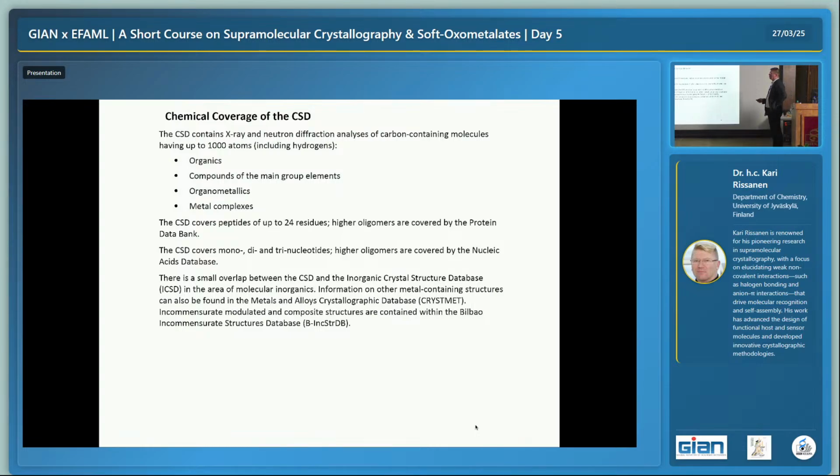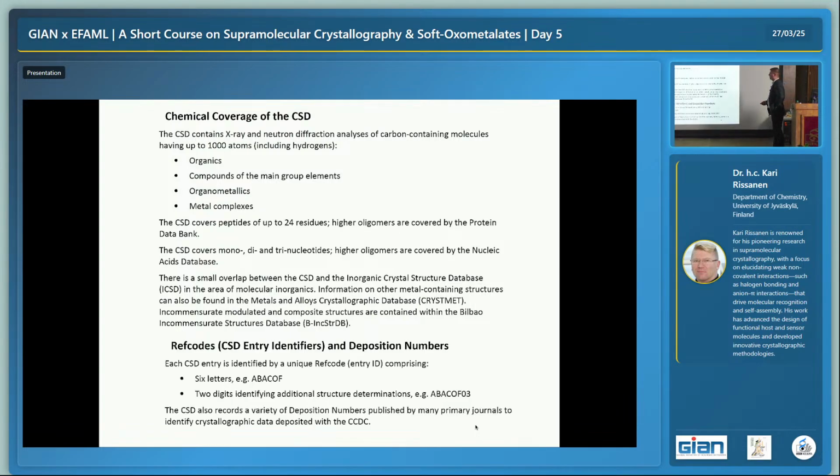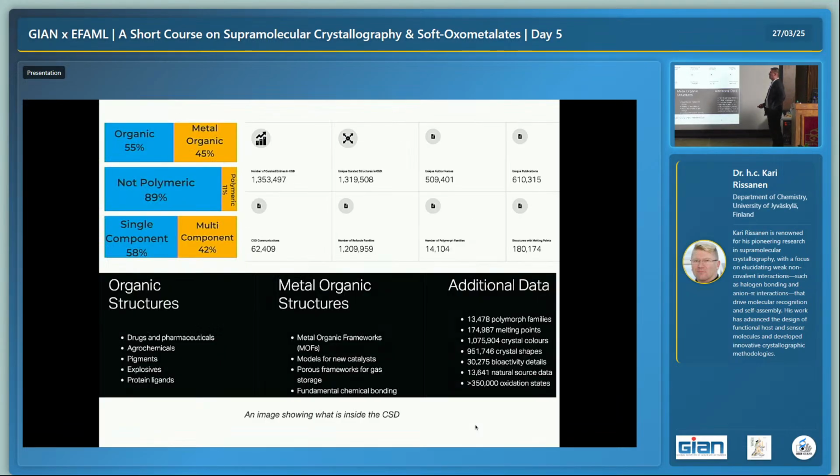They say that normally what you have to have is a carbon-hydrogen bond. But carbon is the essence. For example, some metal polyoxometalates are there, in many cases. But if it would be purely a hydrogen carbonate, it would not be there. And then, as you sometimes might see, it's called the ref code. Each entry, each structure has its own individual code.